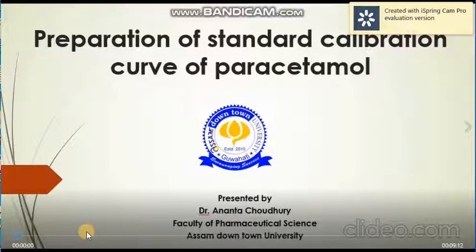I, Dr. Ananta Choudhury, Faculty of Pharmaceutical Sciences, Assam Downtown University, would like to welcome you all to this practical session. Today's practical is preparation of standard calibration curve of paracetamol.